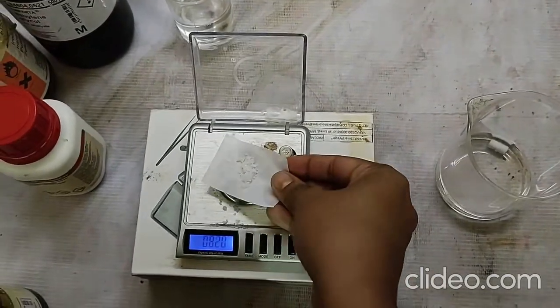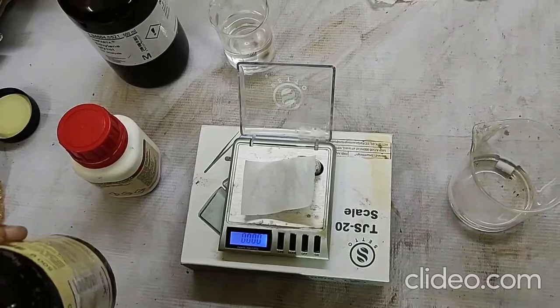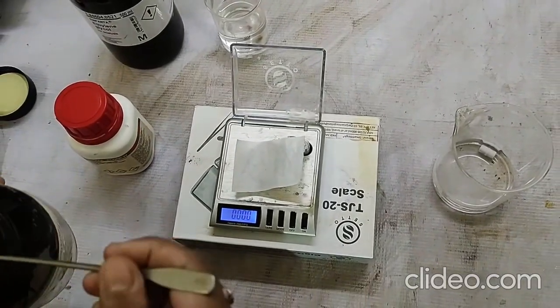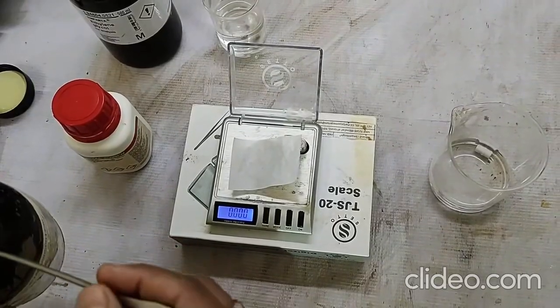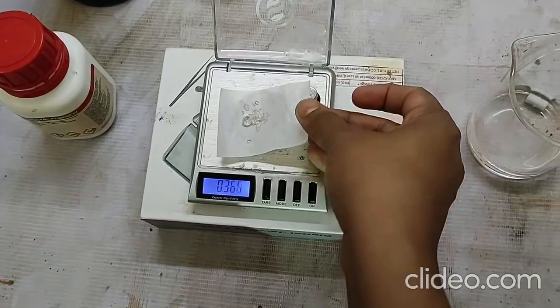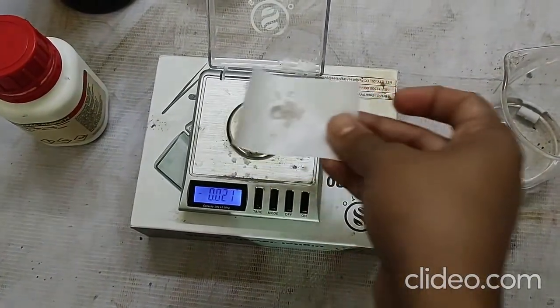Now this bismuth nitrate is added to the ethylene glycol solution. Next we have to measure the ferric nitrate, about 0.636 gram. Now this 0.636 gram of ferric nitrate is again poured into the ethylene glycol solution.